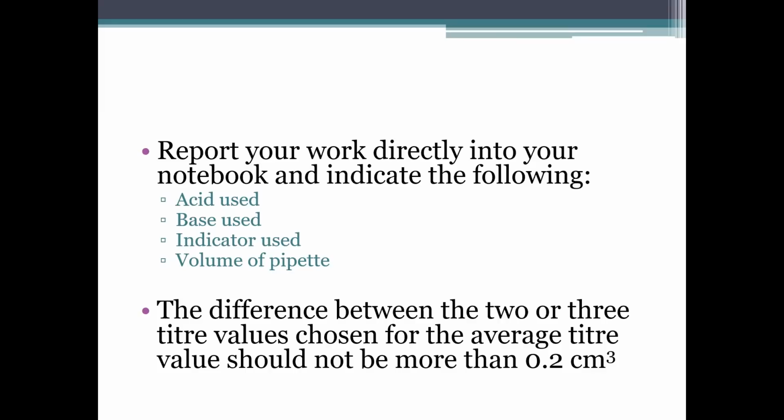Your lab notes will be endorsed by the lecturer in charge or the assistant, the person assisting the lecturer. The lecturer will endorse your notes. So if you have written your practice, your reading, on a piece of paper, you will not get any mark. So always ensure that you do your work directly.